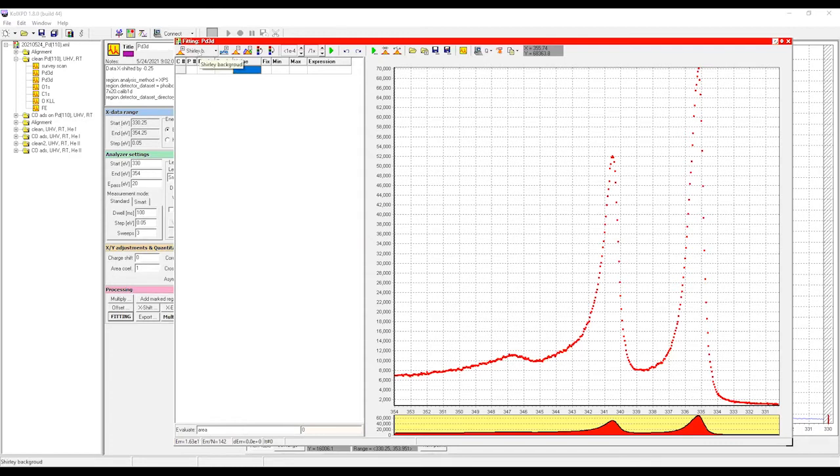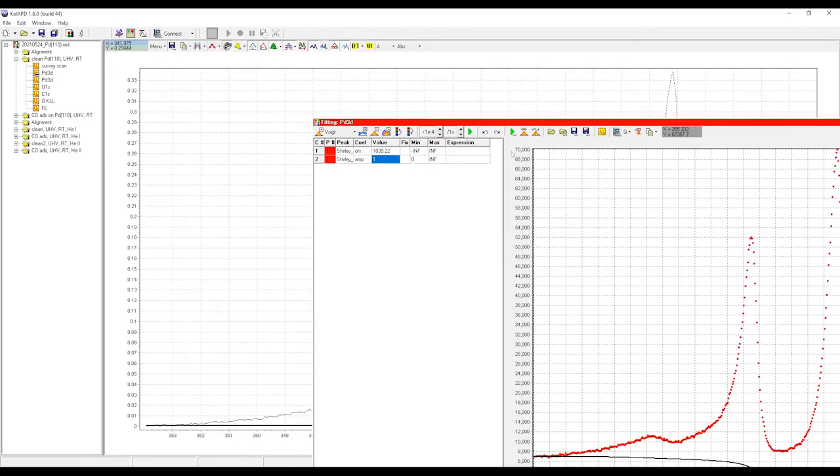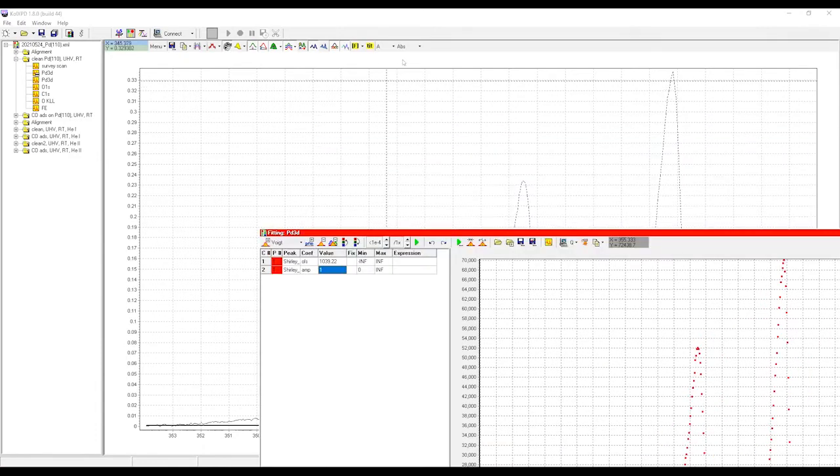I haven't done the full overview of the software. Is the library of elements also included, or is it separate from the software? Yes, they wanted to include it somehow, that guy, because he moved from our group. I think he included sensitivity factors.